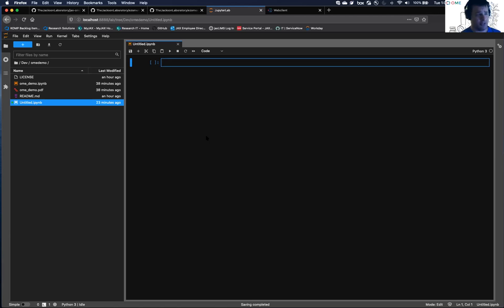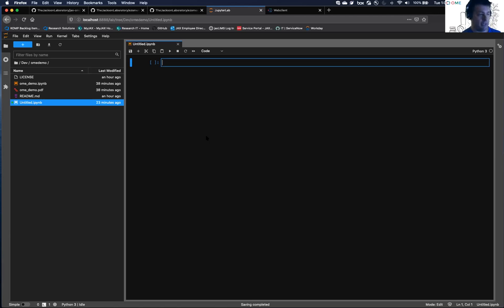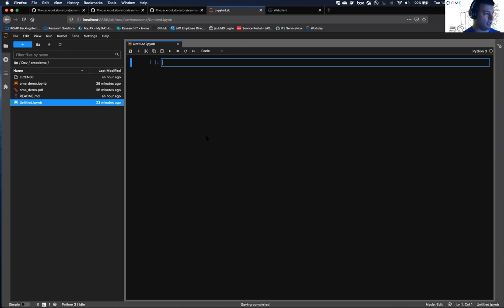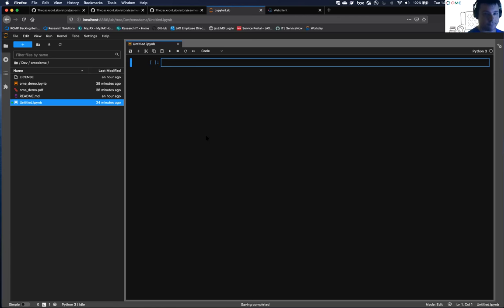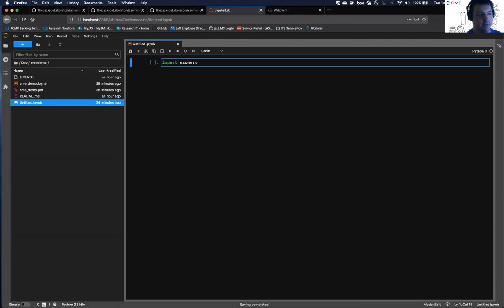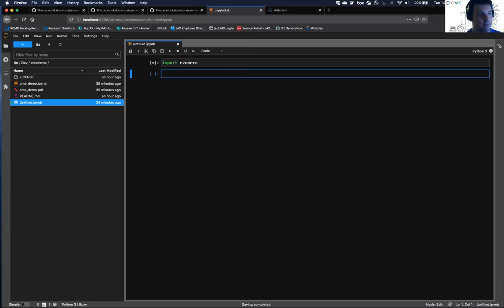I'm using a conda environment here. It just has Python 3.7. EasyOmero is installable via pip. That's a pip install, and then all of the dependencies, including OmeroPy, are automatically installed. And then Matplotlib for visualization.